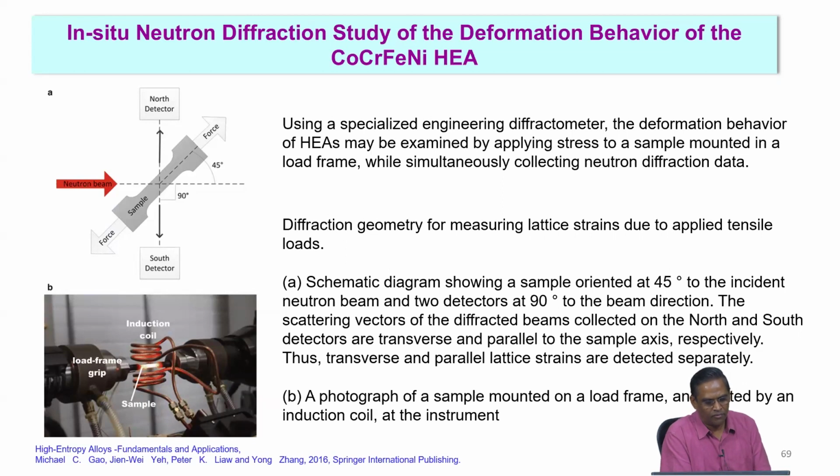So, you have neutron diffraction facilities in India, in the DAE labs, but internationally, a lot of labs are accessible to everybody; all academic people can go and do these experiments. And for a complex high entropy alloy deformation study, neutron diffraction will shed light in much more detail compared to the conventional deformation or in situ study in electron microscopy or X-ray diffraction.